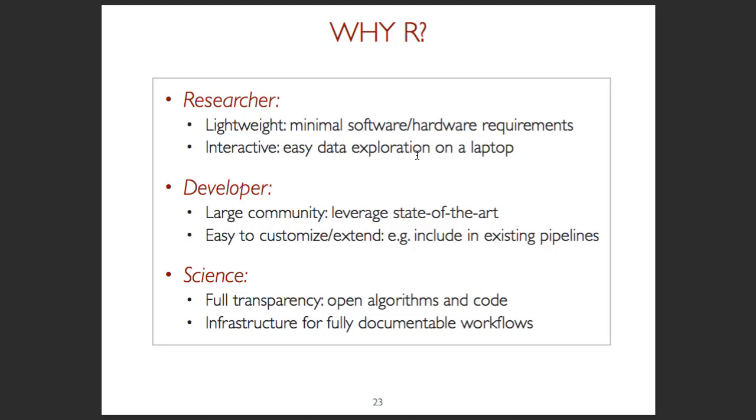For developers like us, it is really important because there's a large community of developers of statistical methods who rely on R, meaning that we can leverage the infrastructure and the methods which are developed by others. And we do this quite a bit. A lot of MSstats actually builds on packages by other developers. On the other hand, it's also easy to extend because it's open source and all transparent. So if you work, for example, in an industry environment or in a core facility environment, you can essentially take these R scripts and embed them in a much bigger pipeline, in a bigger workflow.